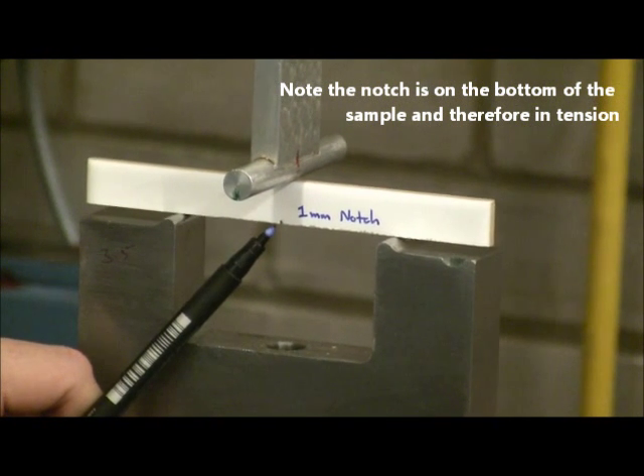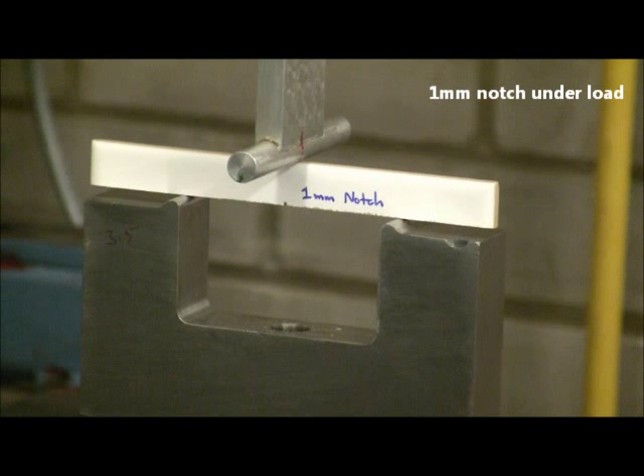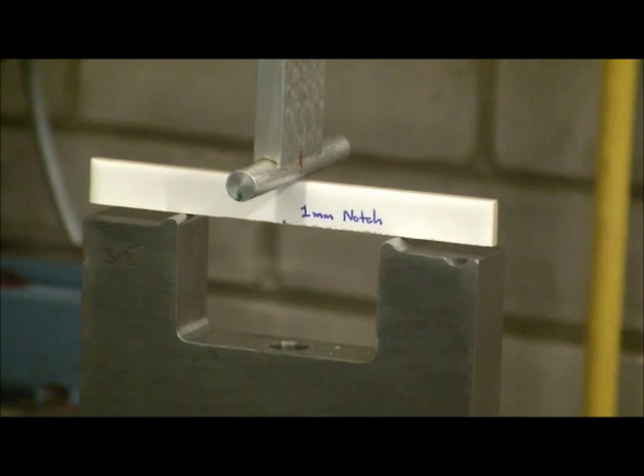It's important that the notch is in tension, not compression. The load is being applied. The viewer will not be able to see that the sample has failed, but it's obvious from the data being collected that the load has suddenly dropped.